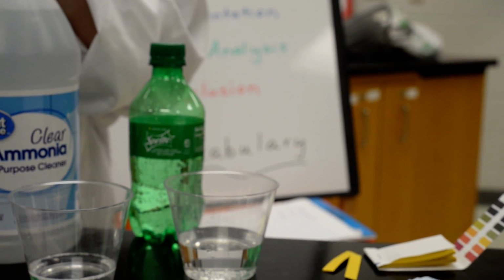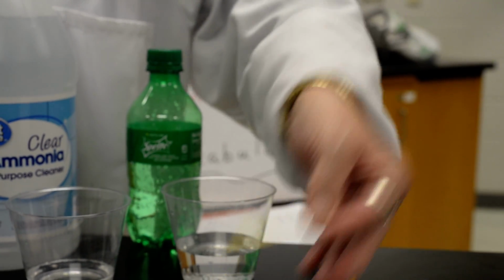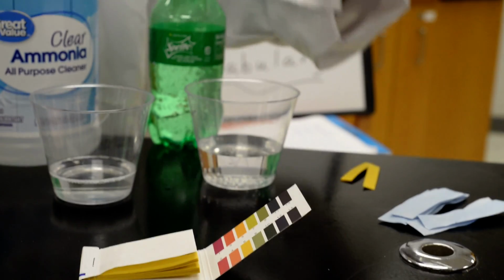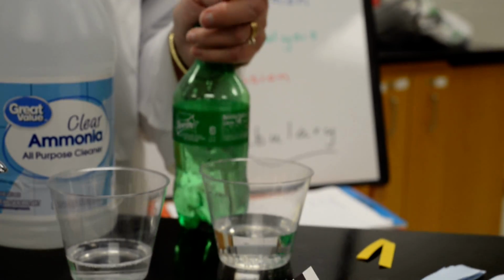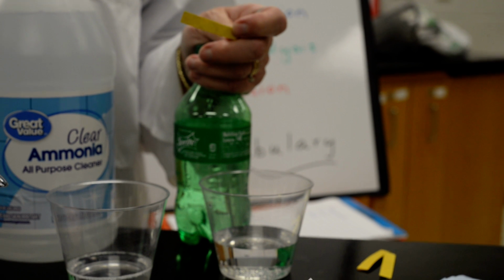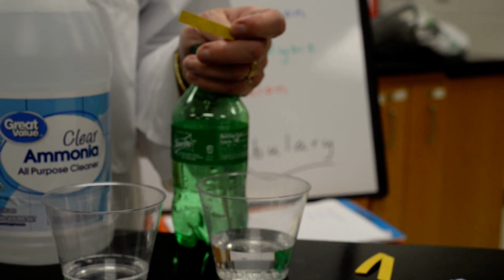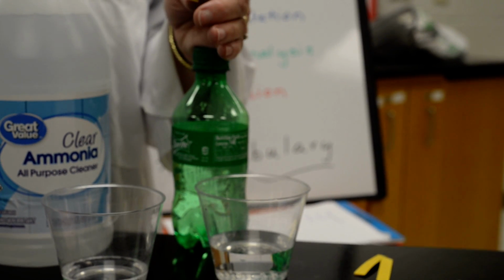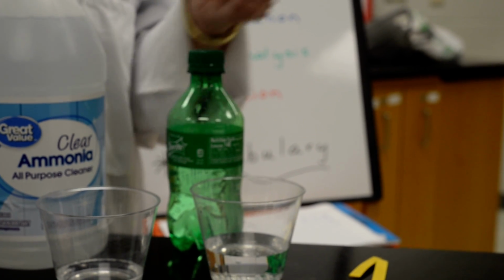So we've got several common things. We're going to look at indicators and see what they are. The universal paper that you buy like this has the different acidities and how much, and we'll do some comparisons using that. So we're going to start with Sprite, and if I were you and doing this experiment, I would ask my kids to make predictions about what was going to be acidic and what was going to be neutral, or on what scale they were going to be acidic. Is it going to be very acidic? Is it just going to be very lightly acidic?